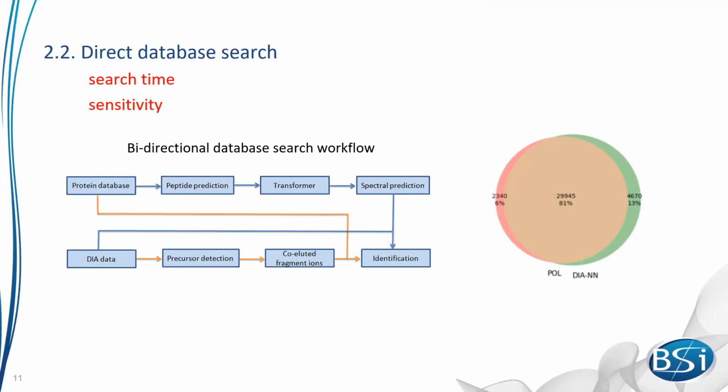To resolve this, we extend our bidirectional search to direct database search. And surprisingly, it also gave good results. We benchmarked with the data above from a recent publication.